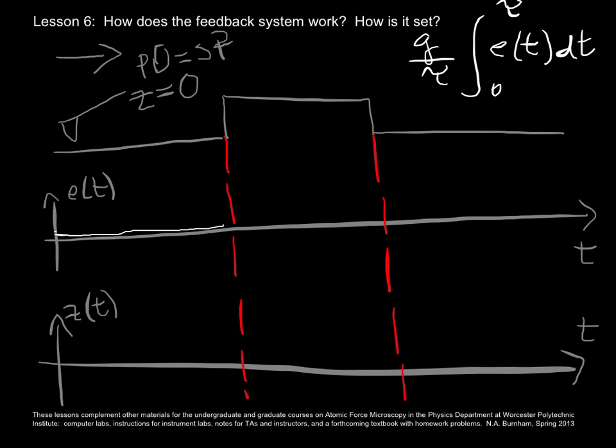When the cantilever reaches an upward step, that becomes non-zero and keeps rising until the scanning system has had time to react, and after it reacts, it starts to fall, such that on the top of the step, the error signal is once again 0.